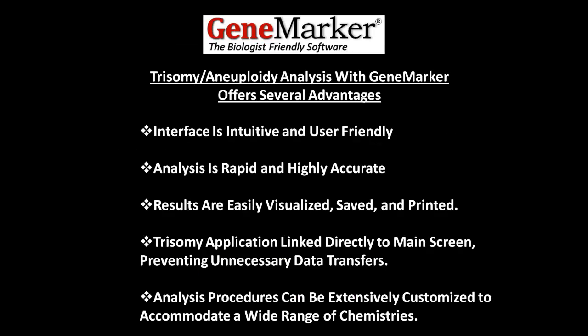Trisomy and aneuploidy analysis with GeneMarker offers several advantages. The interface is intuitive and user-friendly, and analysis is rapid and highly accurate. Results are easily visualized, saved, and printed. The trisomy application is linked directly to the main screen, preventing unnecessary data transfers. Finally, analysis procedures can be extensively customized to accommodate a wide range of chemistries.